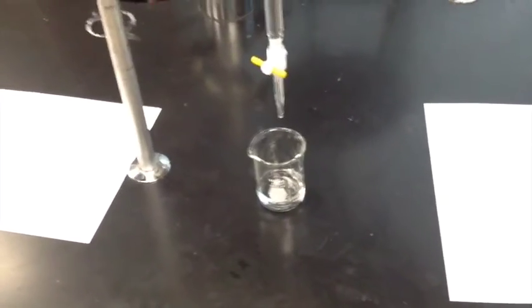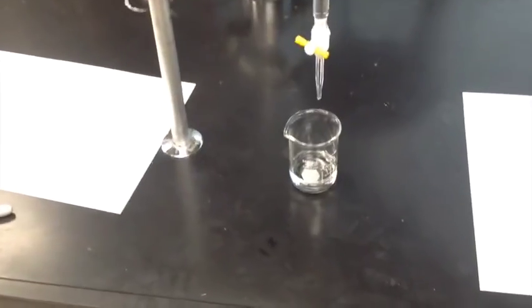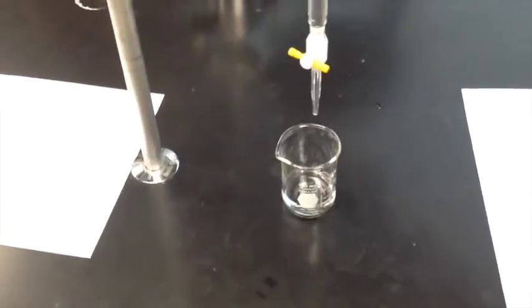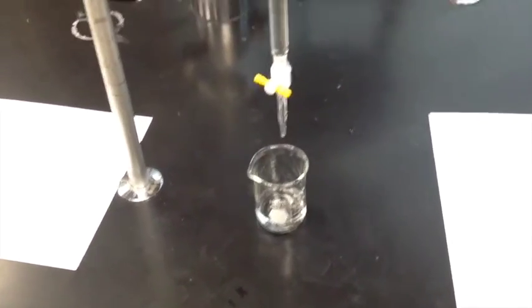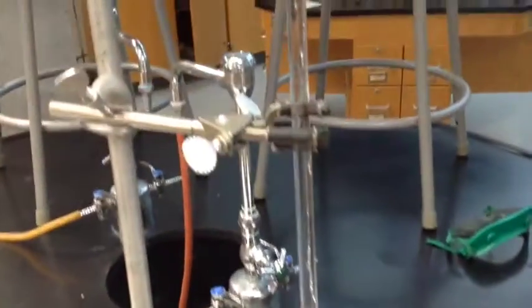All right, now everything here is set up for a rough titration. You can do these things with a little more complexity. Eventually in lab you may use a magnetic stirrer, an electronic pH meter, and stuff like that. But for right now, you have a reaction vessel, which is just a 100 milliliter beaker with some reagent in there, probably just an acid. And you have the tip of the burette up to the stopcock, and then the body of the burette being held up by a 3-finger clamp, and up to the top where there's a mini funnel to help fill.